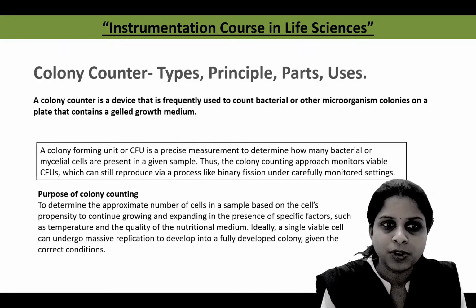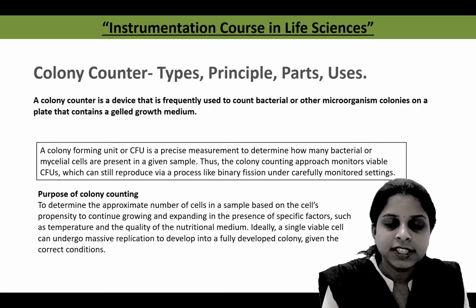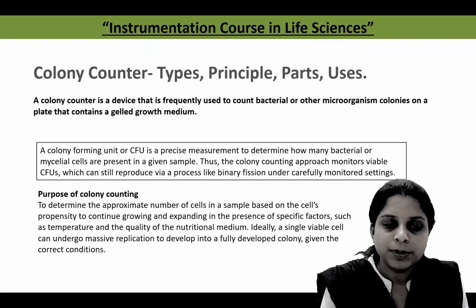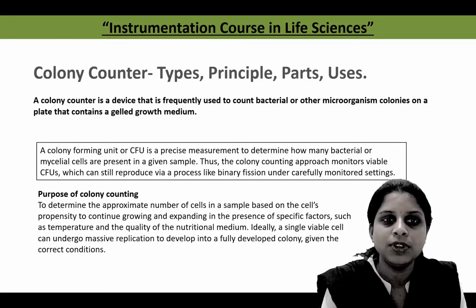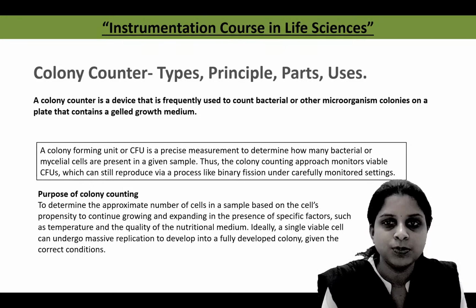Microorganisms are too small, but when they are grown on a solid medium, they develop colonies, and the number of colonies is measured with the help of one instrument, that is the colony counter. Today we will discuss the types of colony counters, the principles on which colony counters work, the parts of colony counters and the uses of colony counters.